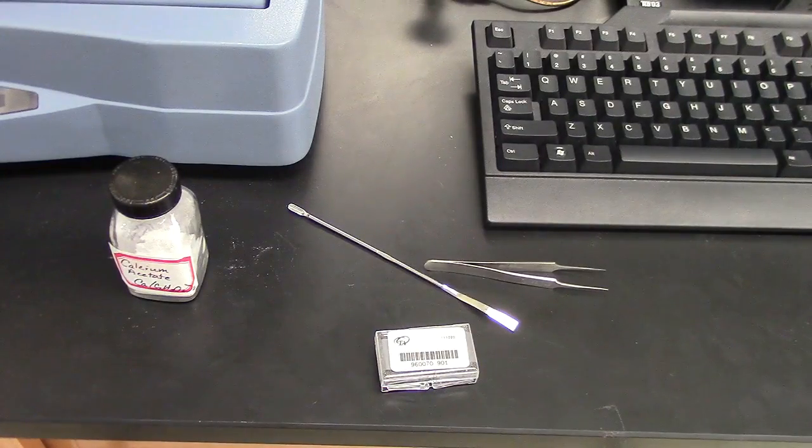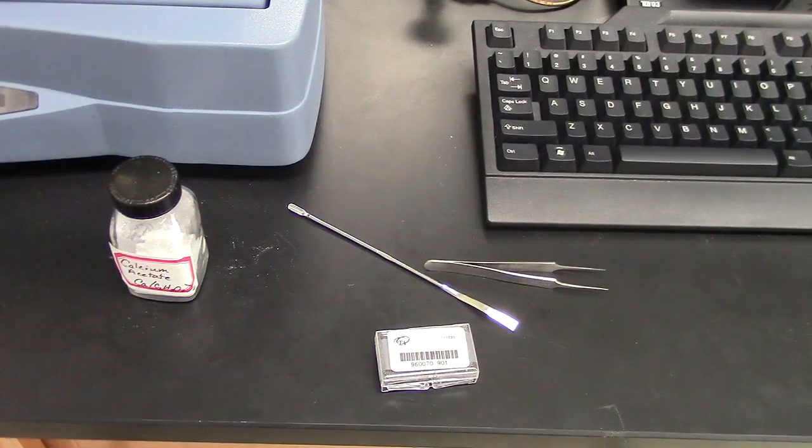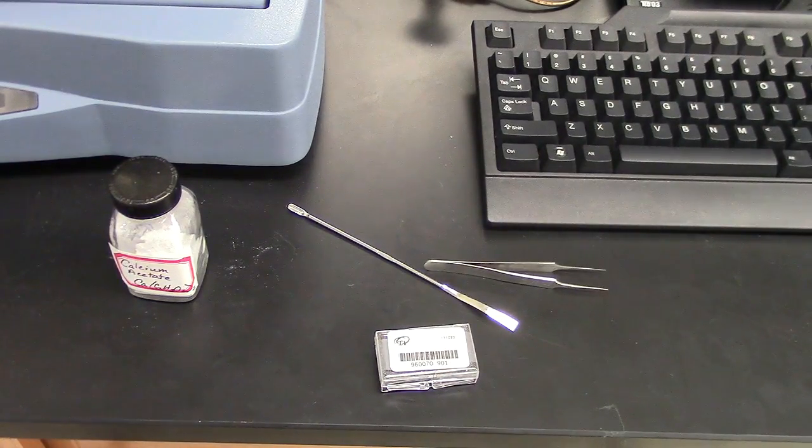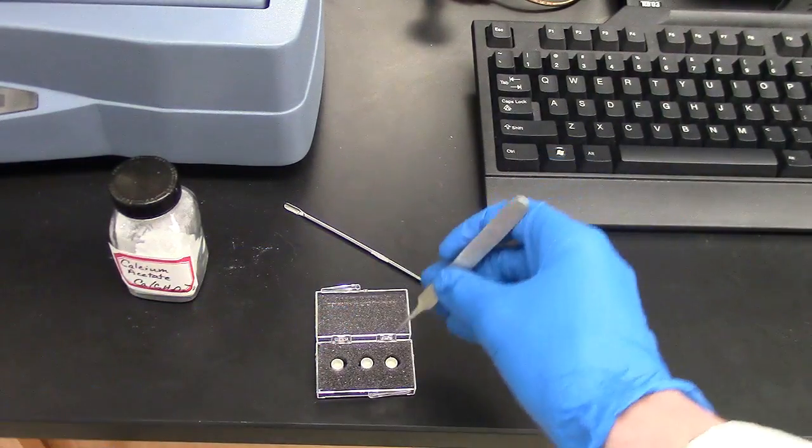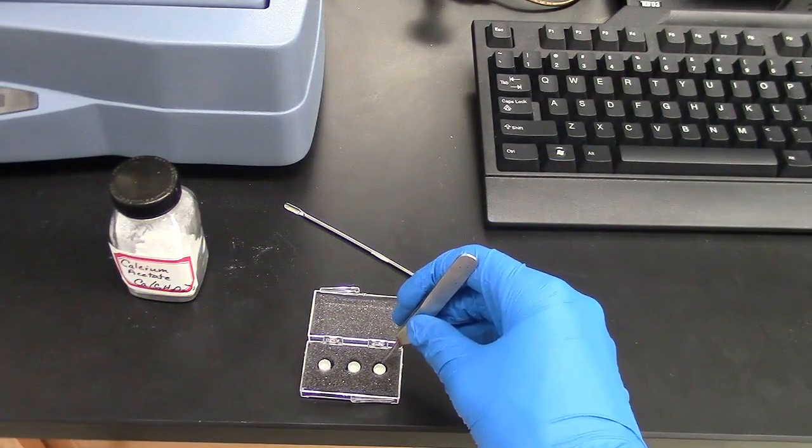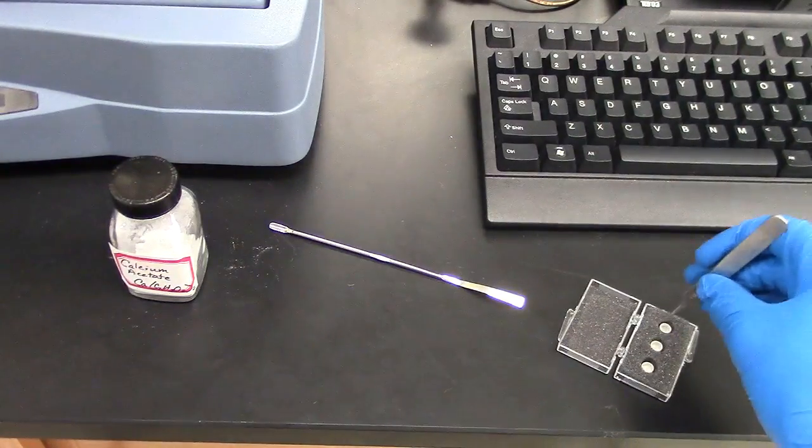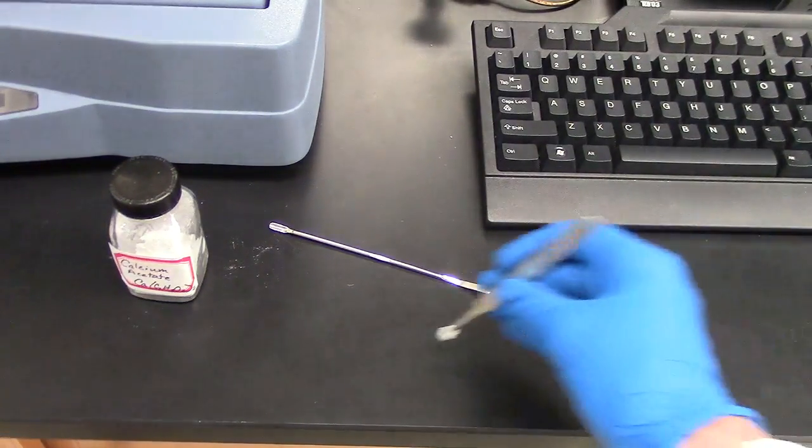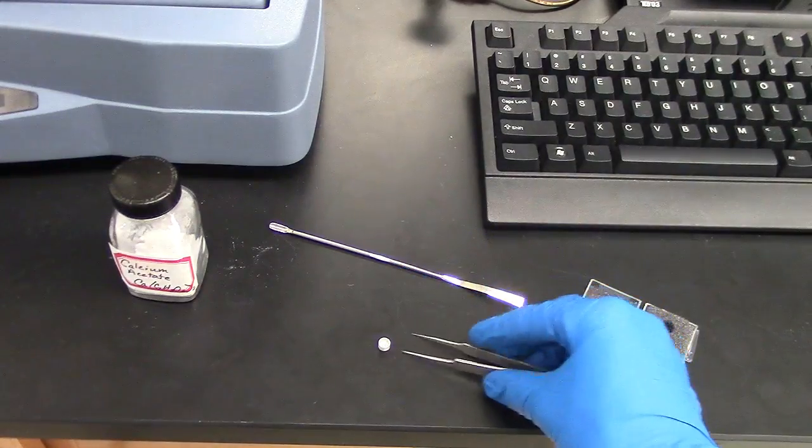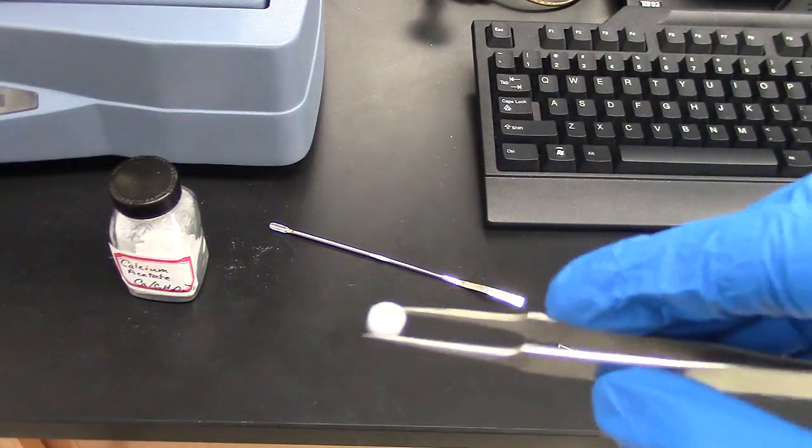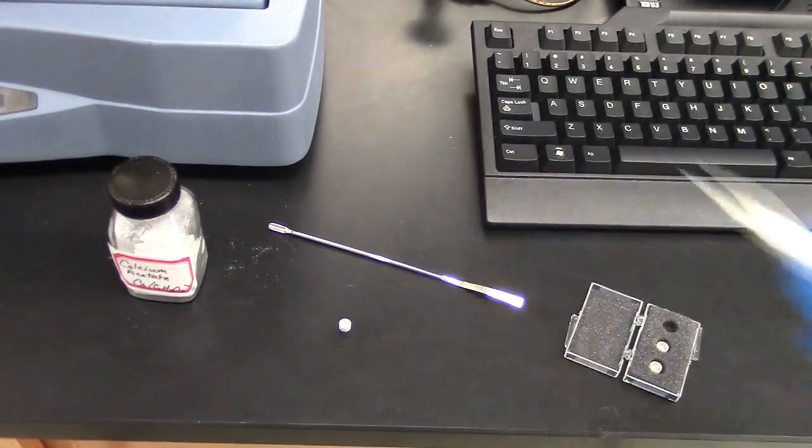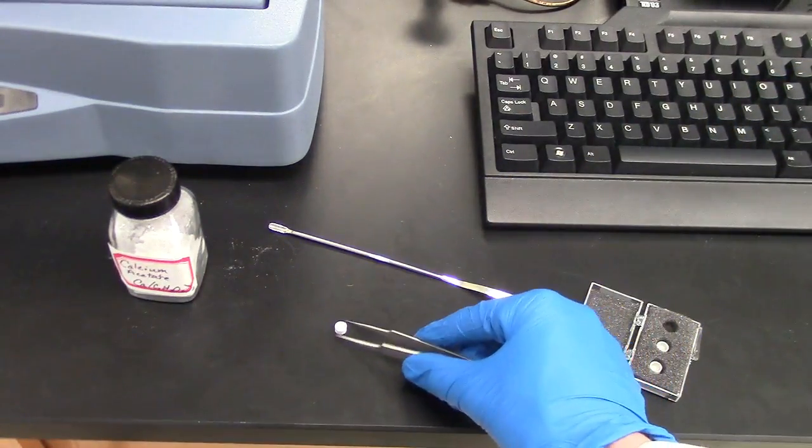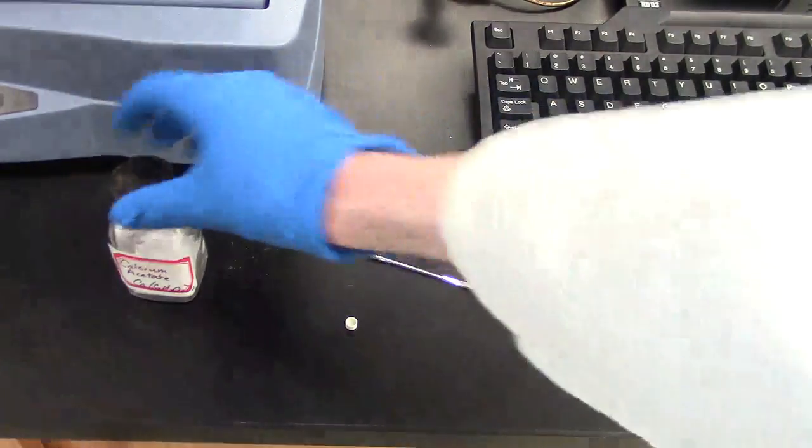After we have ensured that there is enough nitrogen gas flowing to the TGA, we're now ready to prepare our sample. The TGA is basically a very fine balance, a very hot furnace with a very fine balance on the inside. So these are our sample dishes, and it's into these things that we're going to put our sample into.